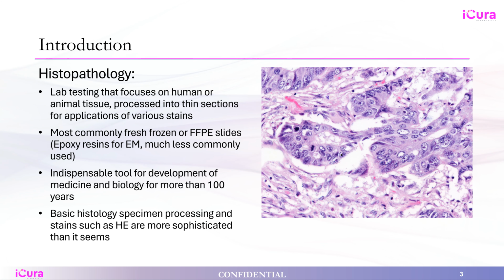Histopathology assays essentially are lab testings that focus on human or animal tissue processed into thin sections for applications of various stains. Most commonly, we use fresh frozen or formalin-fixed paraffin-embedded tissue blocks or slides. Histopathology studies have been an indispensable tool for development of medicine and biology or diagnostics for more than 100 years.